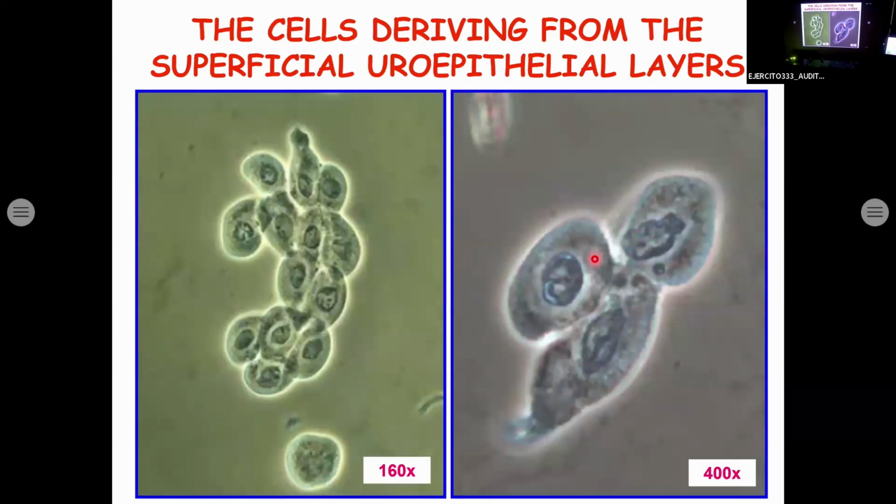This is what we have also published as a table at page 74 of our book, the third edition of Urinary Sediment. So the deep transitional cells, even when they have normal morphology, if seen in high number, are markers of urological disorders or of the presence of a bladder catheter or a ureteric stent.